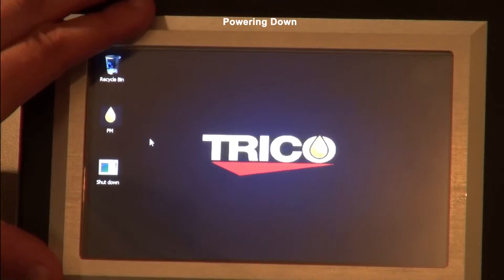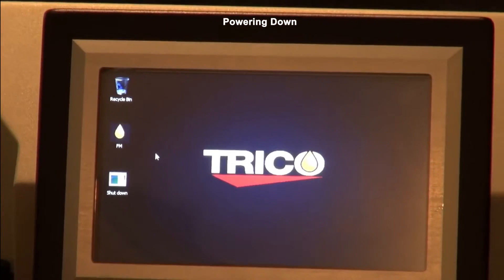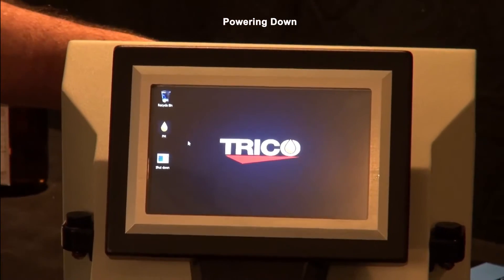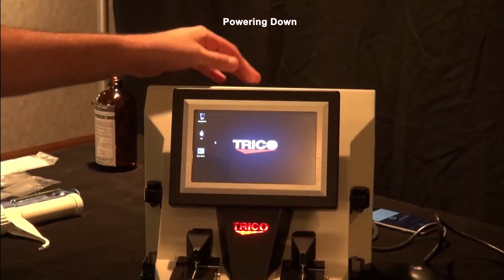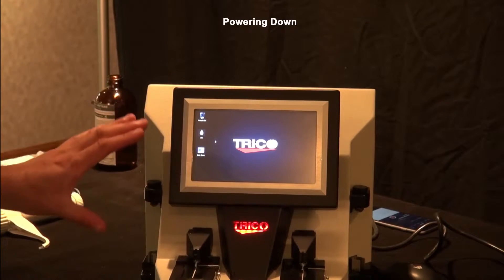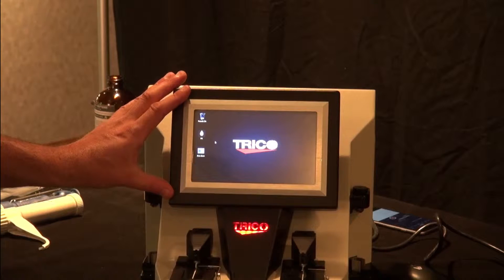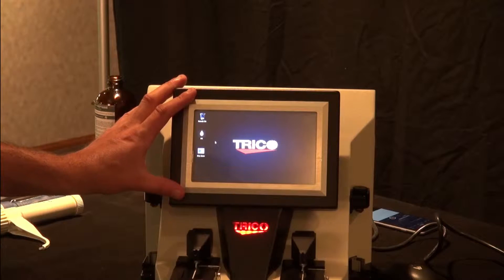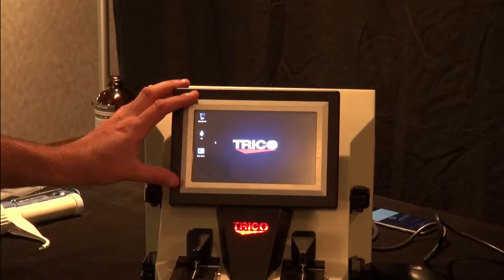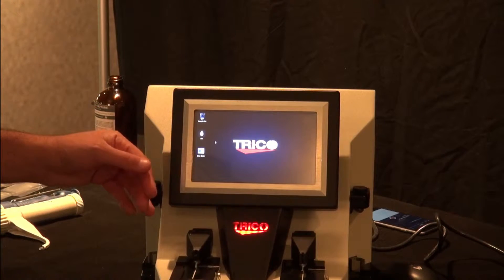The screen will turn black and the only thing left will be the Trico light lit up. Go to the back and switch the switch off, and then you're shut down. You need to do that procedure every time, just like a normal computer. If you don't, the files are incorrectly written to the SD card and you might get some errors with the computer system. Make sure you shut down and start up properly every time.